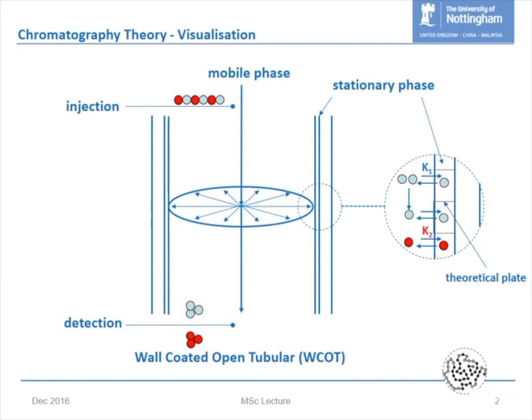Now, if you think about just two molecules, a binary mixture, each of the molecules has something called a separation vector. Okay, and in GPC, that separation vector is size and shape. In lots of other types of chromatography, it could be a certain chemistry, a physical chemical process which allows it to interact with the stationary phase. And what we're really interested in is the dynamics of interaction between a molecule and the stationary phase. And in this little figure here, I've tried to represent that process.